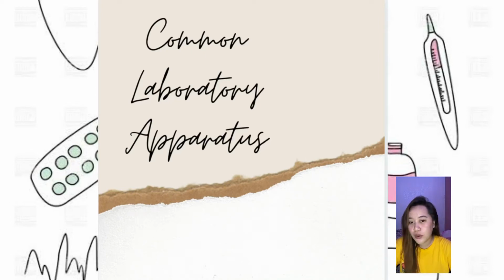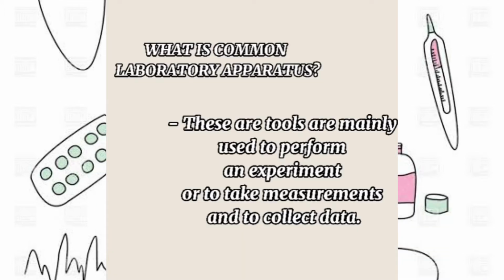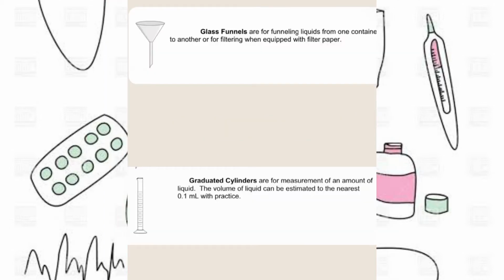For my activity 1, I'm going to present the common laboratory apparatus. But before I start, what is common laboratory apparatus? These are tools mainly used to perform an experiment or take measurements and to collect data. So I have 5 examples of common laboratory apparatus.